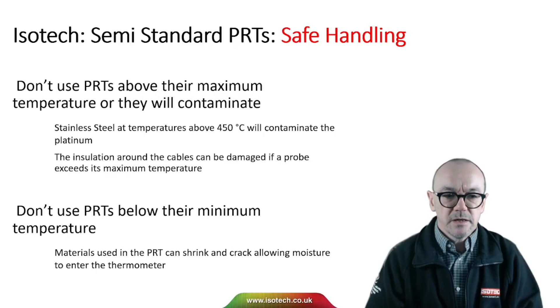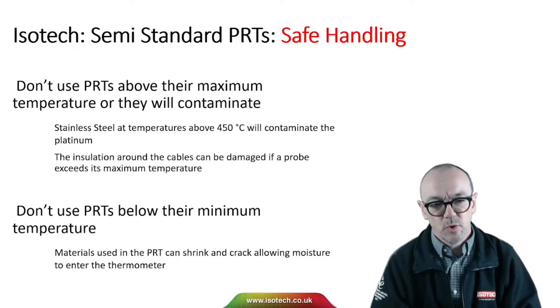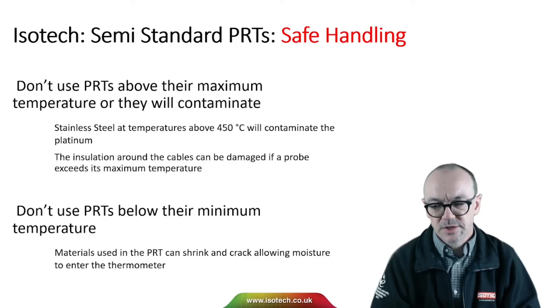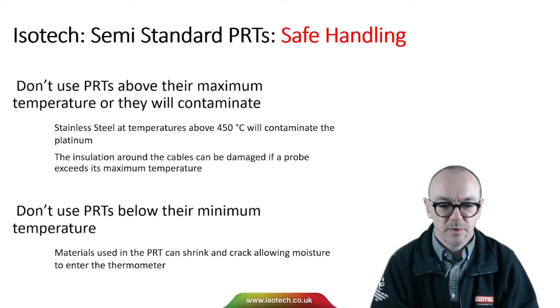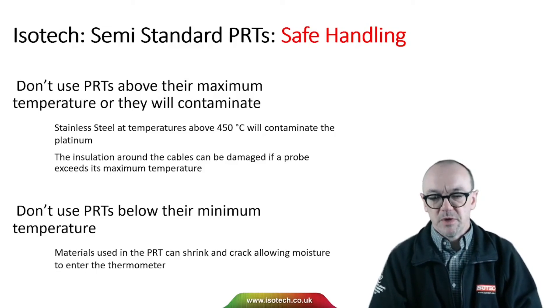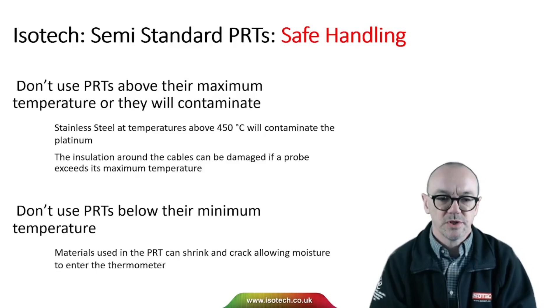When it comes to safe handling, don't use PRTs above their maximum temperature or there will be contamination. Many probes are limited to 450 degrees C because they're made from stainless steel. If you exceed 450 degrees C, gases from the stainless steel outgassing will destroy the purity of the platinum wire. Also, the insulation around the cables can be damaged if a probe exceeds its maximum temperature. Similarly, don't use PRTs below the minimum rating — the materials inside can shrink, crack, and allow moisture to enter.